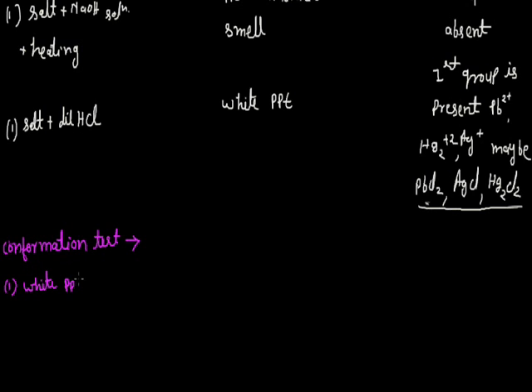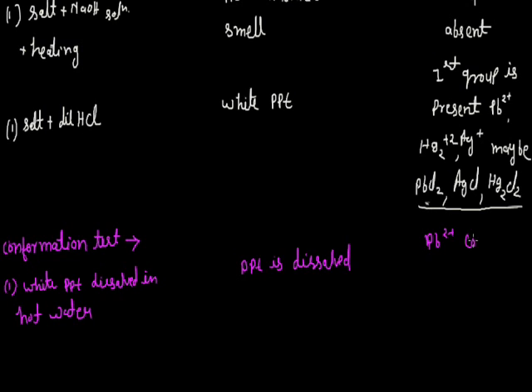If the PPT dissolves, then this indicates that the salt contains Pb plus 2, since the white PPT of PbCl2 is soluble in hot water.